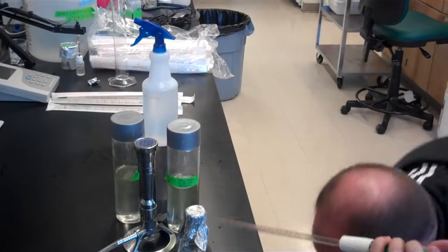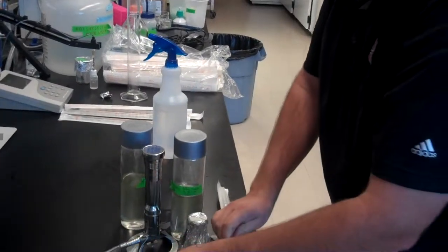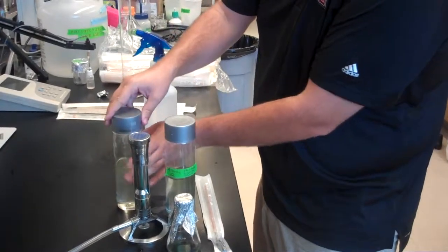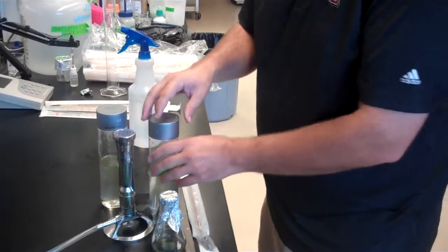This would normally be in my sterile field, hopefully, and I'll just slide that in, take that off, and then I can tighten these up nicely. Now I'm going to keep them tight for now, but when I bring them to their growing station, I am going to loosen the caps once they're inside the growing station to allow for air to get to the algae and for gas exchange.